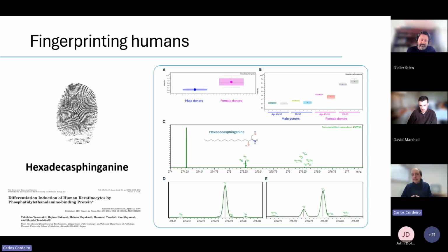So if you have this, and if you have, say, a mass accuracy that is sub-ppm, you can actually obtain molecular formulas very accurately and totally independent from databases. So this kind of ab initio calculation is what magnetic resonance mass spectrometry provides. And from this, you'll use this information to, through curated databases, get information about what your compounds are. So we are completely skipping fragmentation and any kind of analysis.